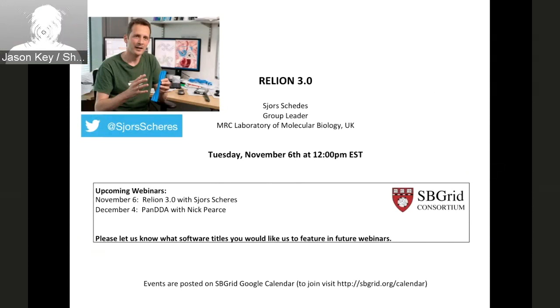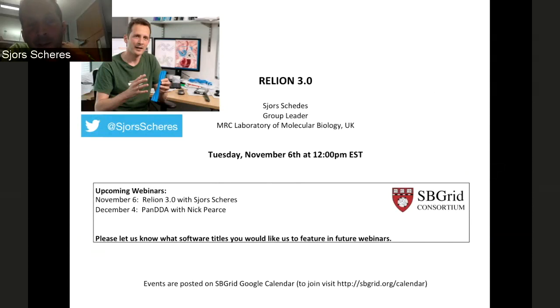Yeah, so you can use symmetry expansion first. So you'll get a much larger star file where each particle is replicated, and then you do subtraction using that expanded star file. So now each original particle will actually become multiple images on disk, each where a different part of the virus is still there, the signal, and then you can refine all that in C1 or classify it in C1.